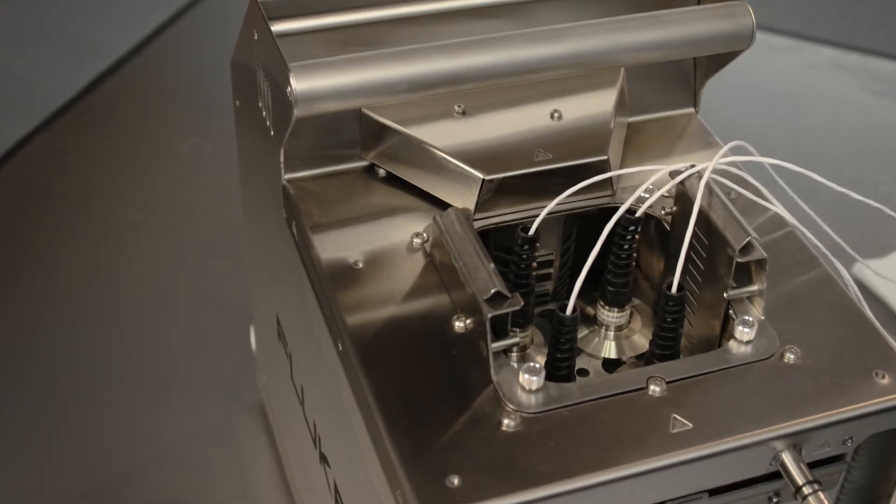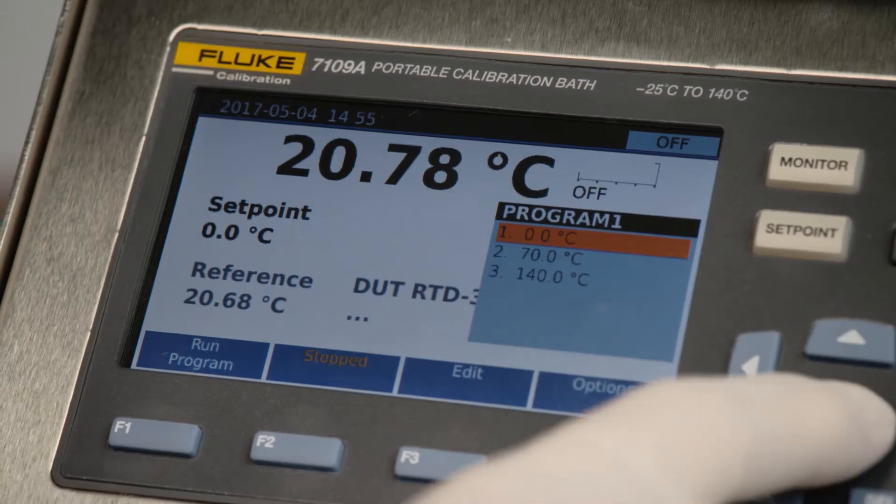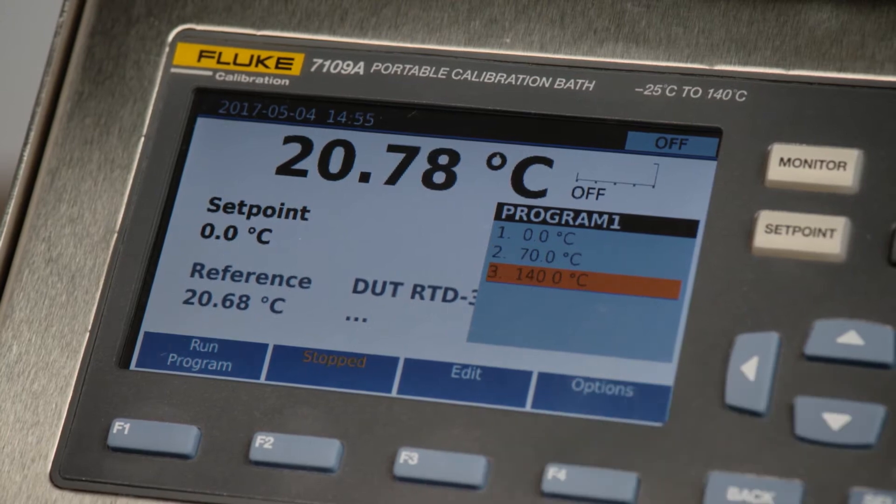The tri-clamp sensors will be calibrated at three temperature points: 0, 70, and 140 degrees Celsius.